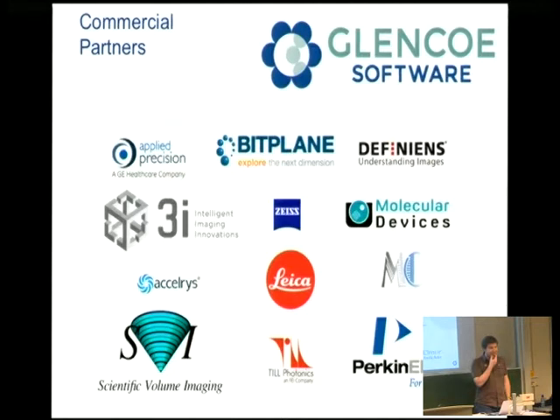But encouragingly, some of the vendors are beginning to use OME-XML as a primary acquisition format, that's really great. And all the time we're seeing pressure from all the users of OMERO software on the commercial microscope vendors and image analysis software providers to support us more, either in terms of just supporting the model, or also in terms of pushing data into OMERO and getting it back out.